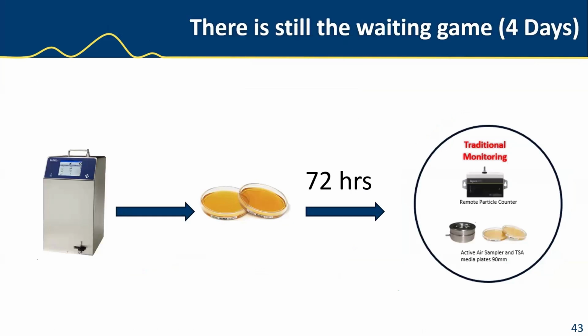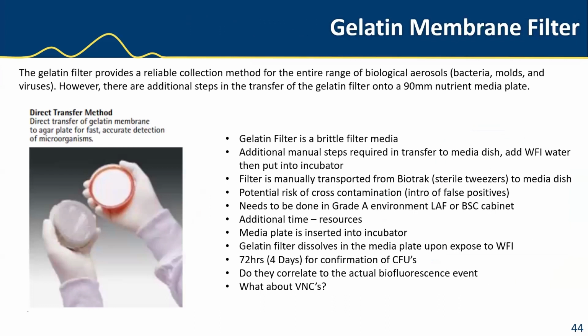And it's the same with traditional methods. You're still waiting for your CFU growth on your media dishes, and your particle counter is still going to act as the flag. So just be aware of the technology and what it represents. You're still playing that waiting game. And also, there are some issues around it.